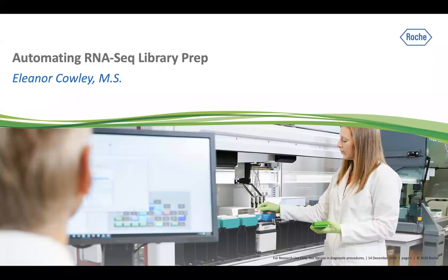My name is Eleanor Cowley, and I'm a Senior Automation FAS for Roche Sequencing. And today I'll be talking about automating RNA-seq library preparation using standard automated liquid handling devices.